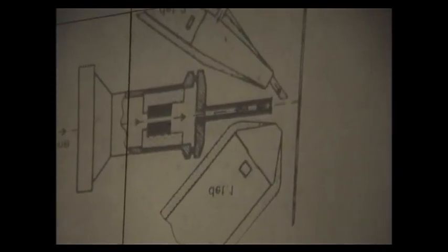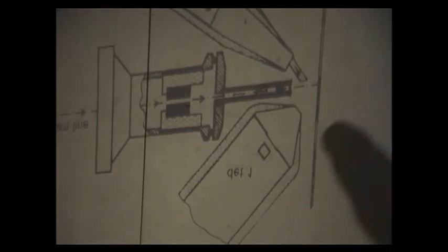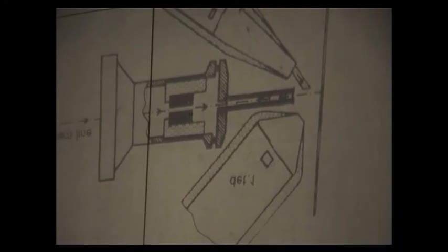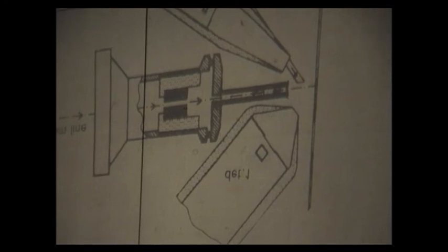The way to avoid that is to replace the exit foil of aluminum by an exit foil of plastic containing only carbon and hydrogen, and to send some helium flow in the region of the target in order to replace the air by helium, in order to replace some materials with an atomic weight of 16 and 14, oxygen and nitrogen, by helium, then in order to reduce the absorption of X-rays.